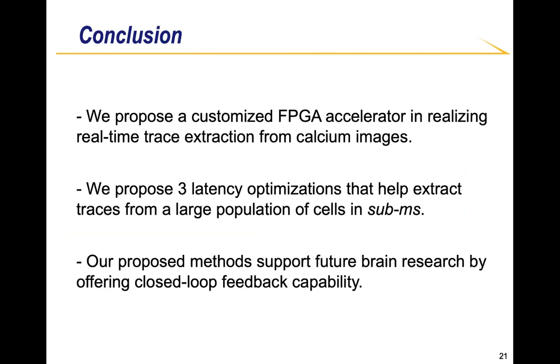In conclusion, in this presentation, we introduced our customized FPGA accelerator for real-time trace extraction from imaging. We discussed the 3 latency optimization methods. By combining these 3 methods, the overall latency of the processing pipeline can be reduced to below 1 millisecond. With that, I believe our proposed methods have the potential to enable closed-loop feedback capability for future brain research based on in vivo imaging.